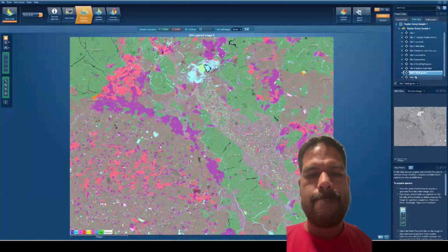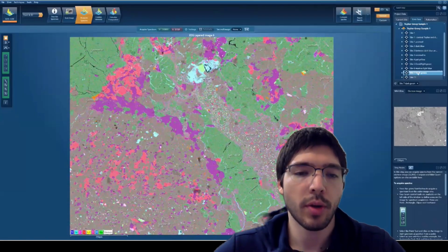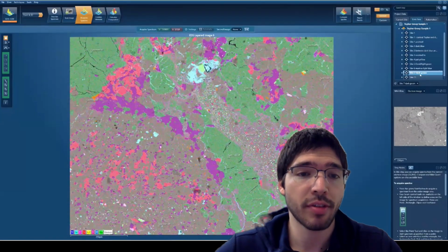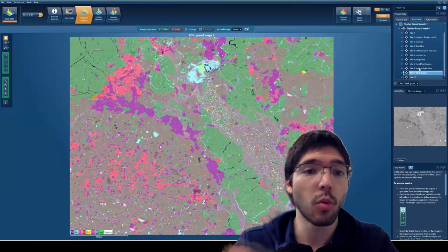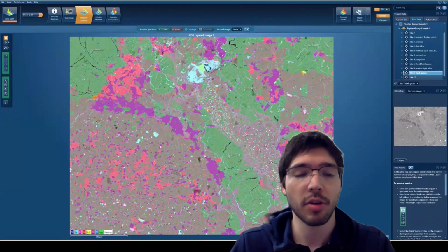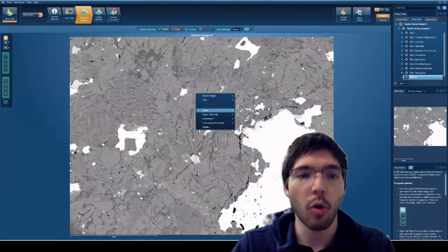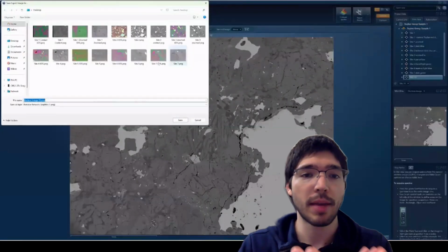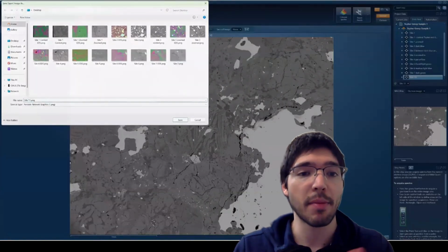Yeah, no, Mike, that's a great question. It's very important. Obviously, we analyze thin sections, so you first have to take those samples and turn them into thin sections. But it's very important to know what material you are going to look at. So the first thing I always do is try to see images of the whole rock as best as I can, just images of slices, and try to see, does it look the same on different stones?